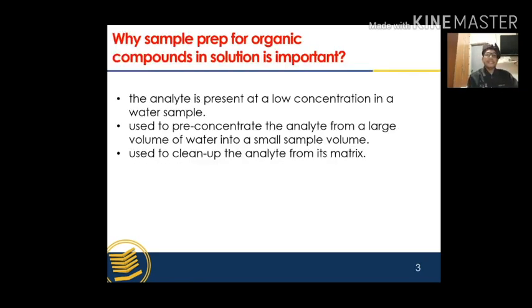Okay, let's start with our first learning outcome. Sample preparation of liquid for organic analysis is very important. Sample preparation is required when the analyte is present at low or trace concentration in a water sample, such as river water or wastewater effluents. For example, we want to detect pesticide in a river water sample from Cameron Highlands. The pesticide might come from agricultural runoff and be present in a very trace amount.